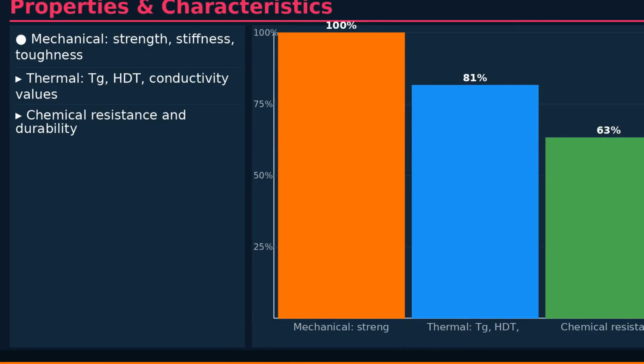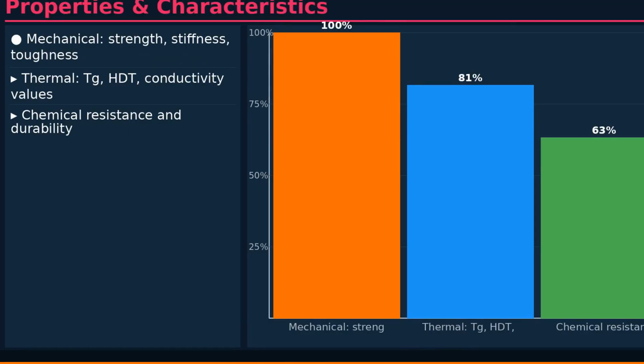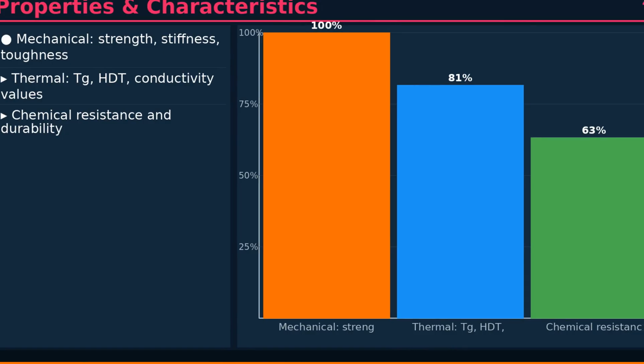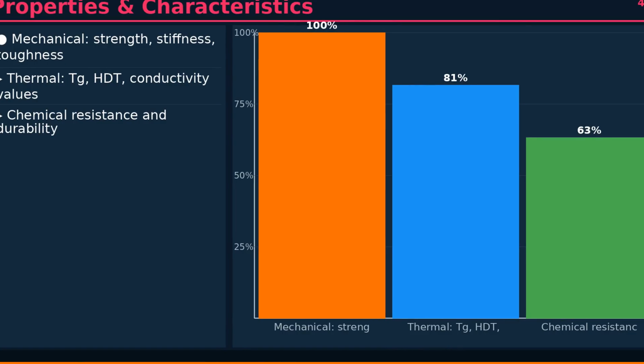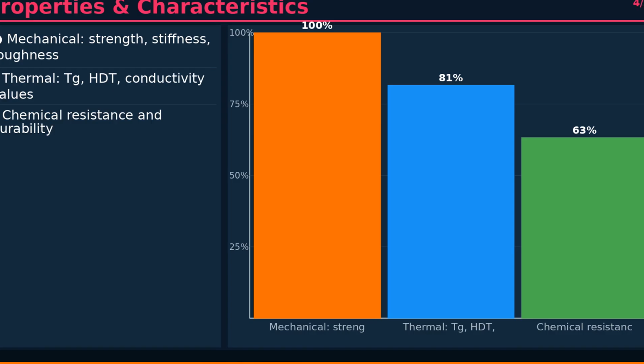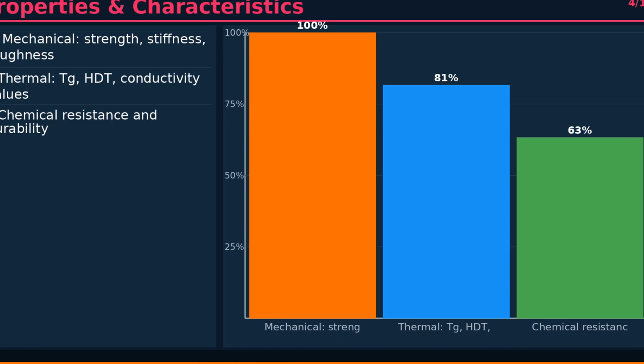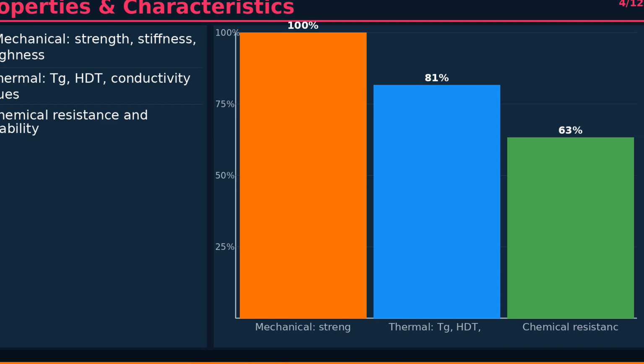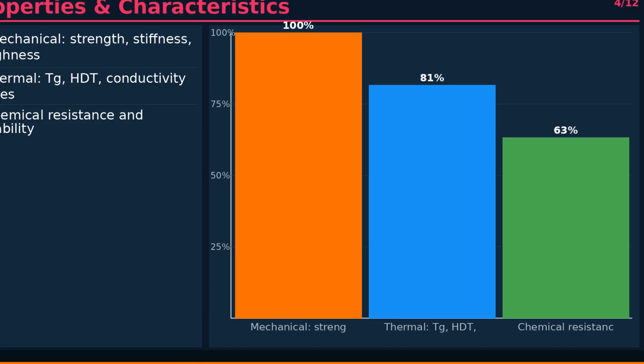The properties of tensile testing of plastics on UTM machine span mechanical, thermal, and chemical domains. Tensile strength, heat deflection temperature, and chemical resistance are the most important parameters. These values directly determine service life and product quality.